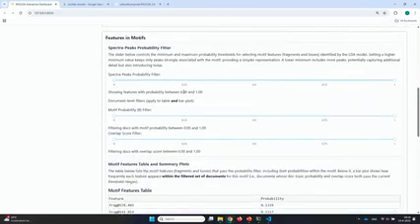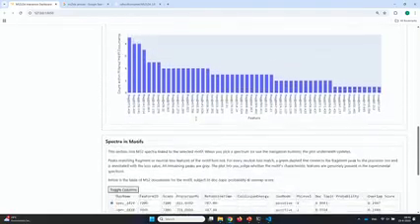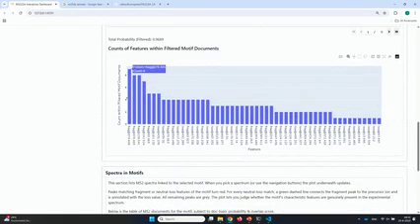Okay, let's go down here. As I said, you can see again the fragments listed, ordered after the probability. And the first task would now be to tell me, okay, based on the optimized fragments, how often do they occur in your data set? So you have, for example, for 141, you have it 7 times in your data set. For 158, you have it 8 times.